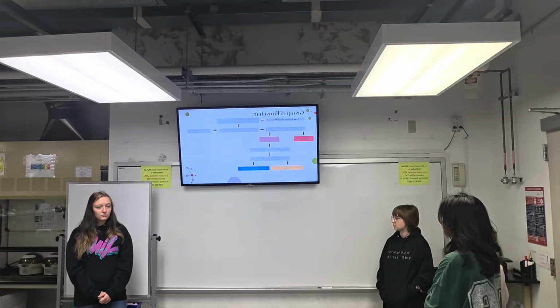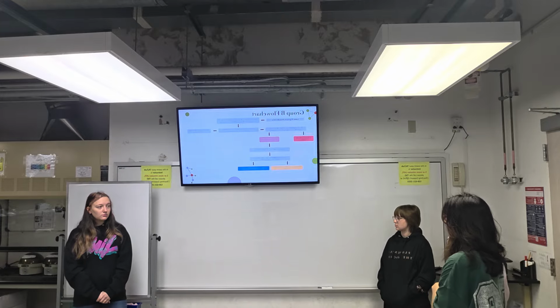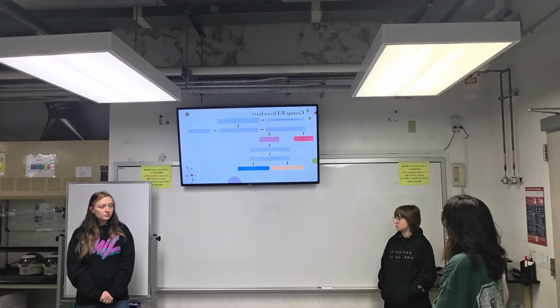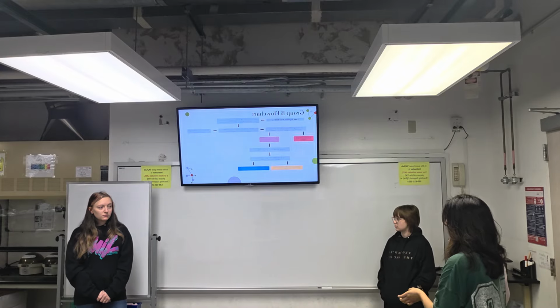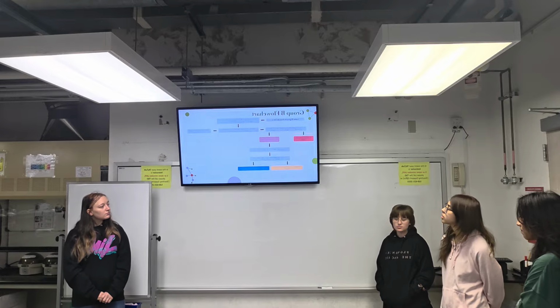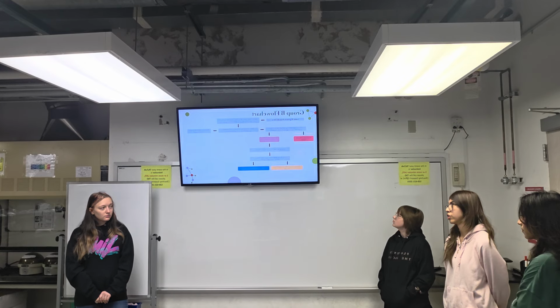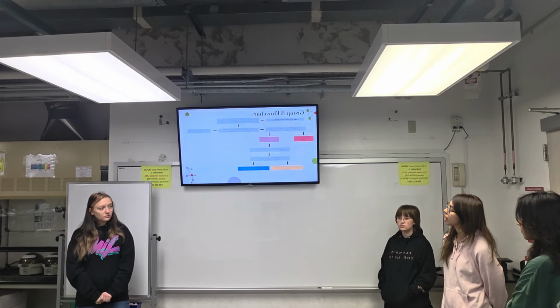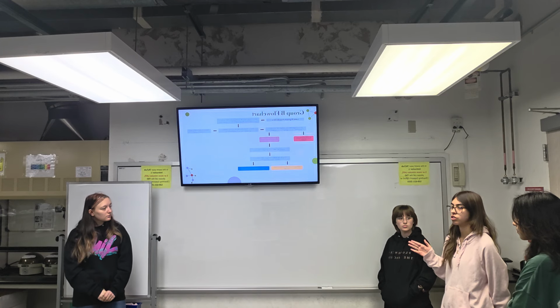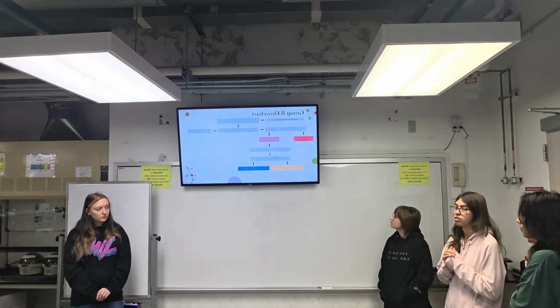But then she had to get the blue dye and the orange dye separated, so she put 1 milliliter of NaOH into the vial, and that's what separated them, so she put them into separate vials. And this is completely different from what we first had for our flowchart, because we did plan on doing the filtration last, but I realized it would be easier to see what's separating for the colors, so we did go to this step.